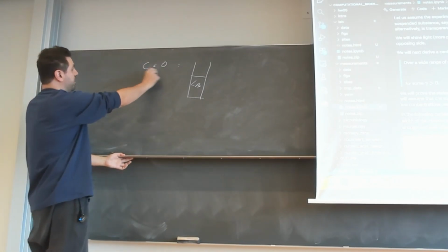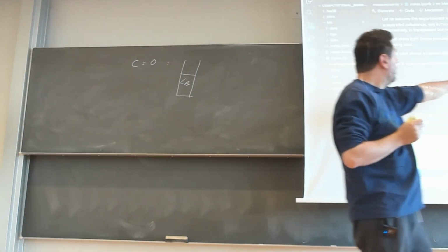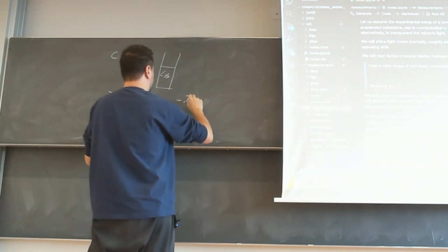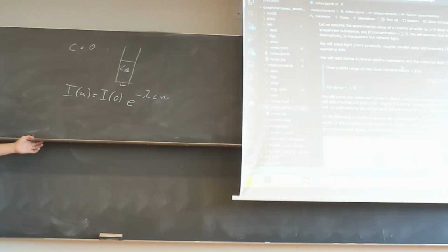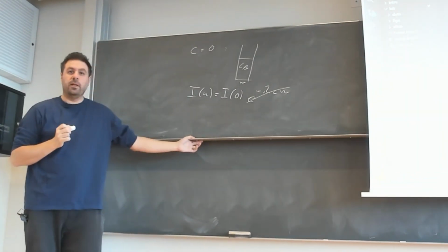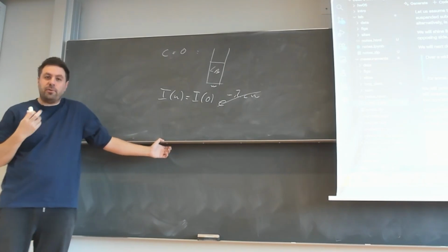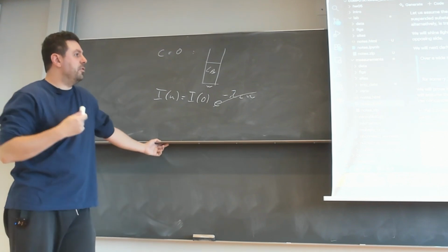But if we set it to 0, so we put 0 E. coli inside, and now we use our formula here, right? So what is our formula? Let's call this W, the width W of our cuvette. If I set this to 0, that goes away because it's 1, and it tells me exactly the same output light as input light. That's totally true for something totally transparent, but it's definitely not true for my LB. So to be precise, I cannot use this formula for LB.